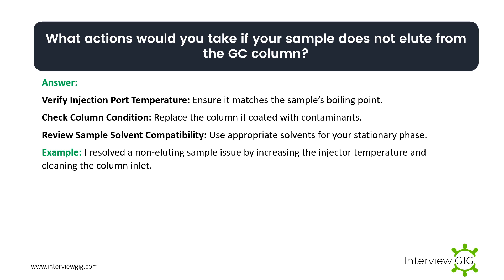What actions would you take if your sample does not elute from the GC column? Verify injection port temperature — ensure it matches the sample's boiling point. Check column condition — replace the column if coated with contaminants. Review sample-solvent compatibility — use appropriate solvents for your stationary phase. Example: I resolved a non-eluting sample issue by increasing the injector temperature and cleaning the column inlet.